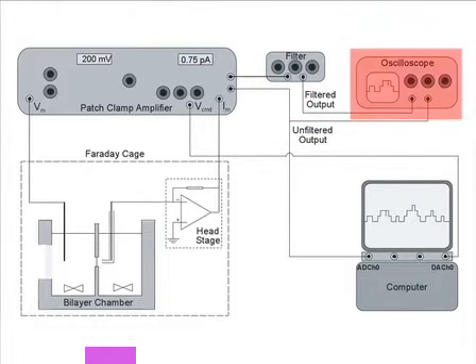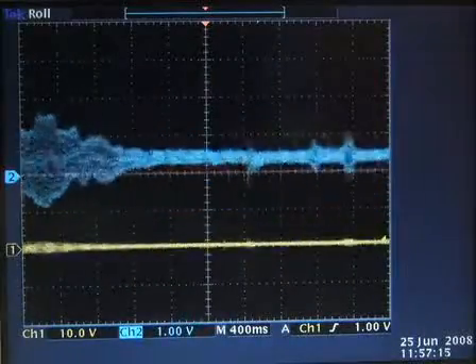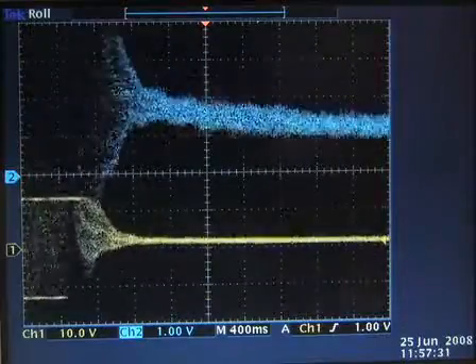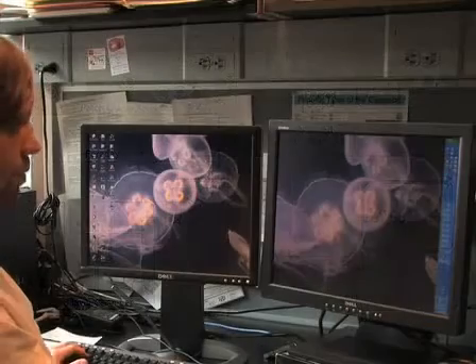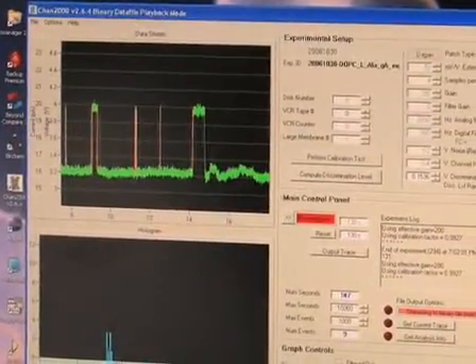An oscilloscope is used for displaying the current signal, both the output from the patch clamp amplifier and from the electronic filter. You will also need a computer with a data acquisition system that digitizes the patch clamp signal at 20 kHz. We use an in-house developed software for data recording and analysis. All of the equipment is turned on 20 minutes before beginning.